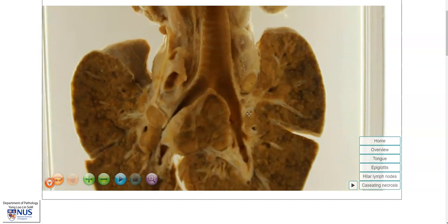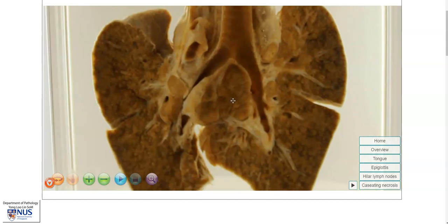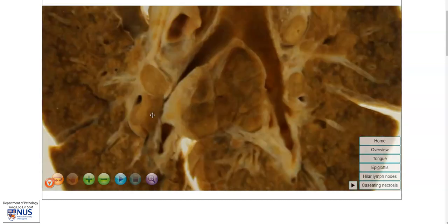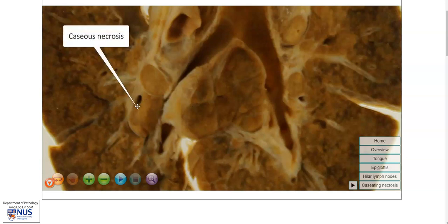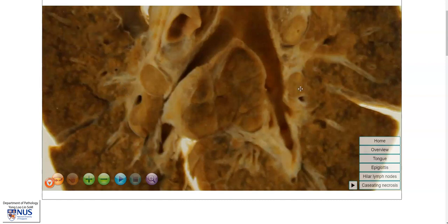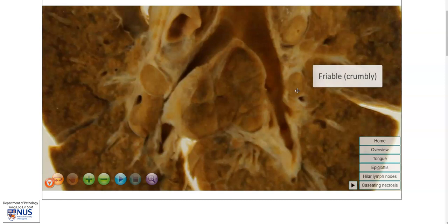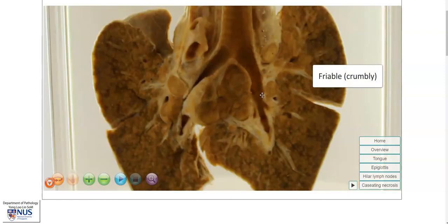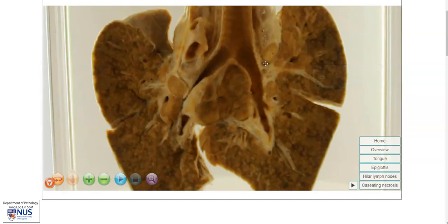In the lymph nodes, in the hilar region as well as the mediastinum, the nodes are enlarged, and we can also see that the cut surface of the nodes appears heterogeneous, with these paler areas of caseous necrosis. Caseous means cheesy, so grossly these areas of necrosis look a bit yellowish, and in the fresh specimen they would look a bit friable or crumbly, or they will look as if they are breaking apart.